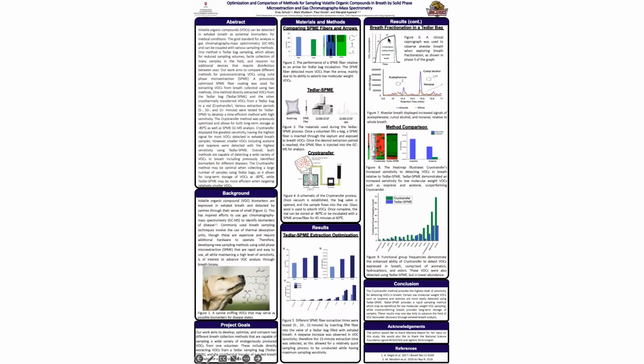Hello, my name is Eray Schulz. I am a second year chemistry PhD student at IUPUI, and my poster is titled The Optimization and Comparison of Methods for Sampling Volatile Organic Compounds in Breath by Solid Phase Microextraction and Gas Chromatography Mass Spectrometry.